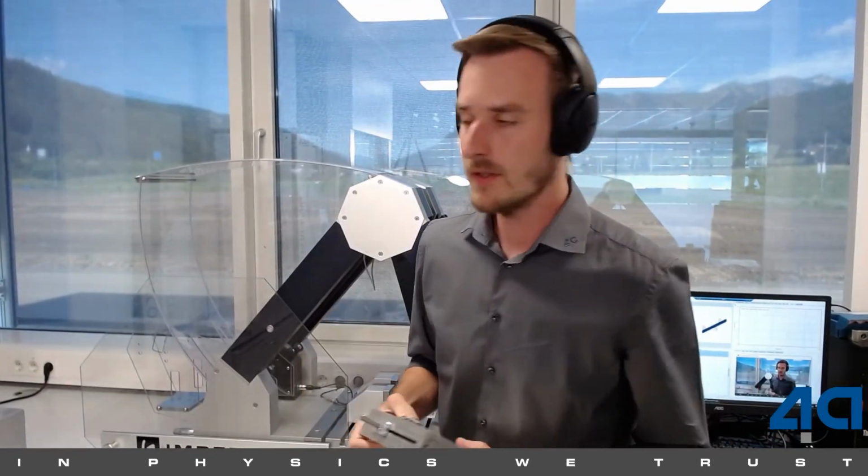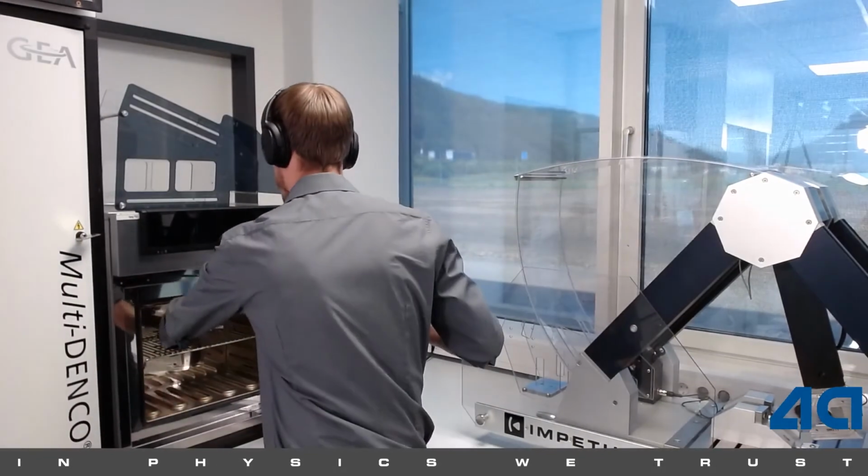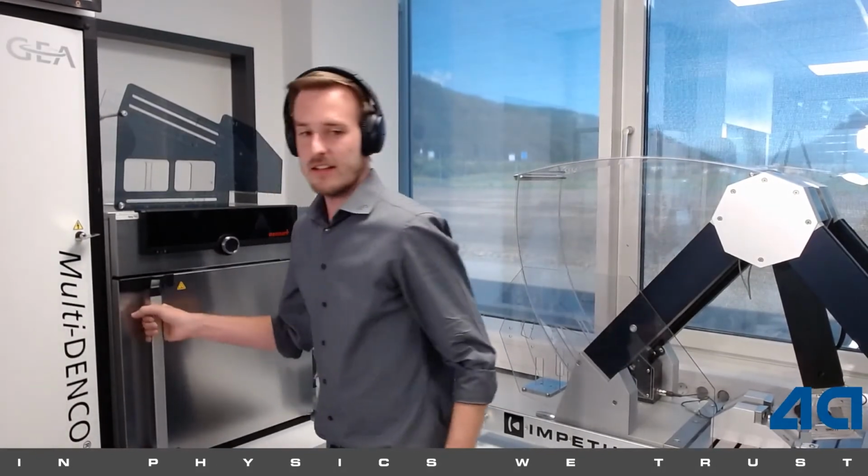And now we put this in the oven, like that. Here it's about 4 hours in the oven until we have the right temperature. When we have to test at 80 degrees, for example, we temper the samples at 82 degrees, so to be higher than we will test.